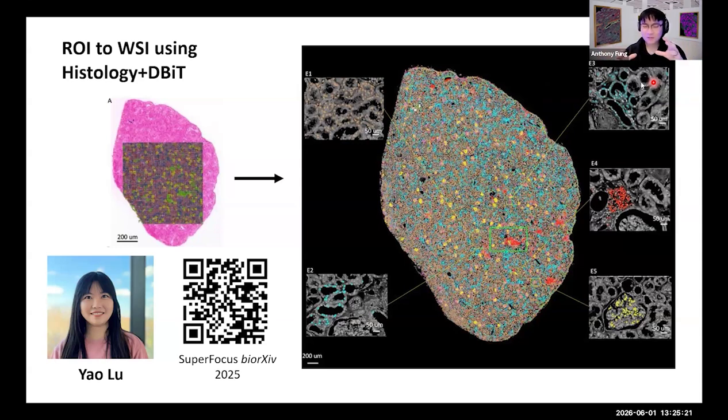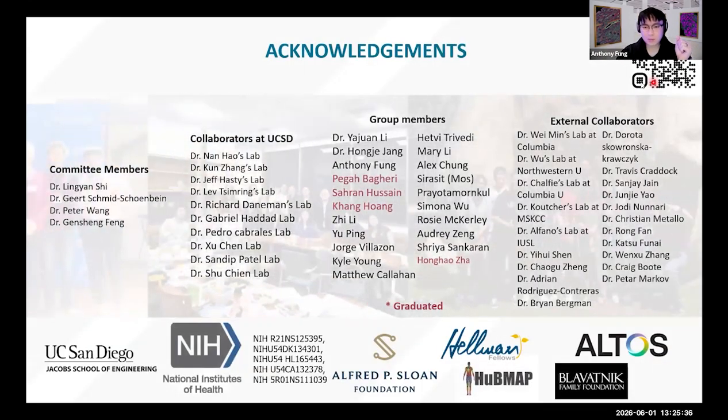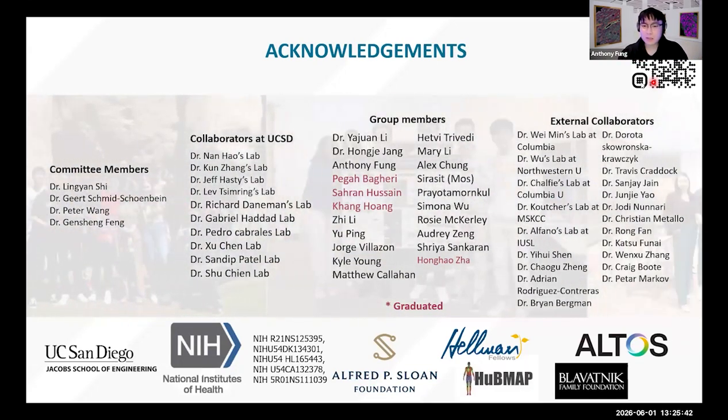provided that we remain at least largely within the sample, or get a representative chunk within our DBiT grid. And that's really important because the histology, since it's label-free, can be done on the exact same sample, so you don't have that whole adjacent section struggle that you would have otherwise.